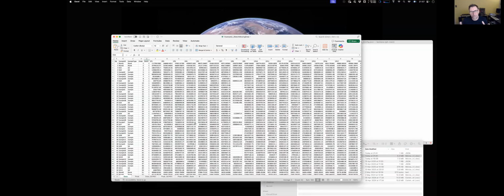What generally happens on a small study is that you will, if you say have a QC every 10th sample. This study is like every fifth sample is a QC. That's what we did in Manchester, when the methodology for untargeted metabolomics has improved tremendously since we wrote that Nature Protocols paper. What we tend to do now is every 10th sample we'll do a QC. Well, you can imagine if you're doing a single batch and you've only got 40 samples, then you're not going to have many QCs. So realistically, you're going to have to put more QCs in than you would every 10th.